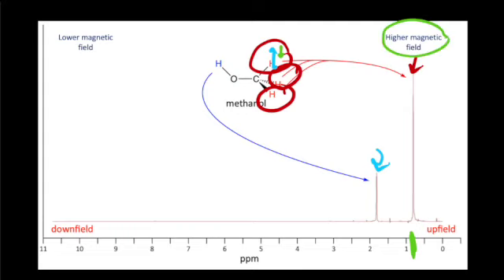This is a higher magnetic field on this side. So we increase that magnetic field, and at this strength of magnetic field, the hydrogens flip. Our detector says, wait a minute, I don't see all the radio waves, and it starts to make a peak. For this hydrogen, its electron cloud is a little smaller around it because it's next to an electronegative oxygen, which sucks the electrons away from our hydrogen atom. The chemistry word is it's de-shielded.